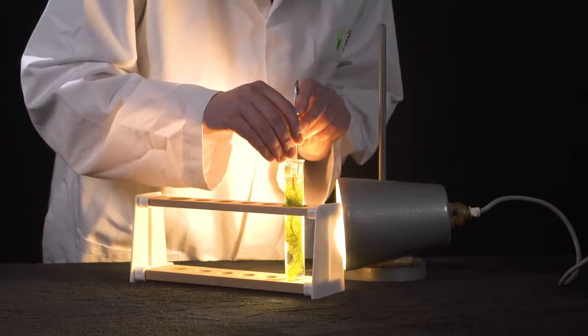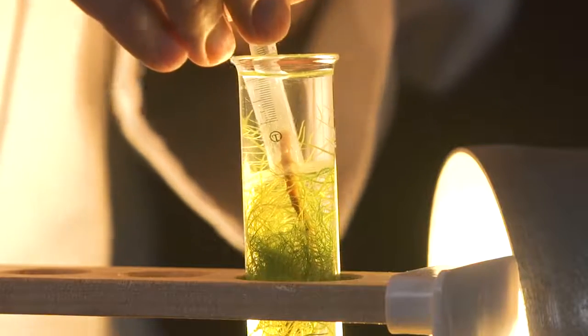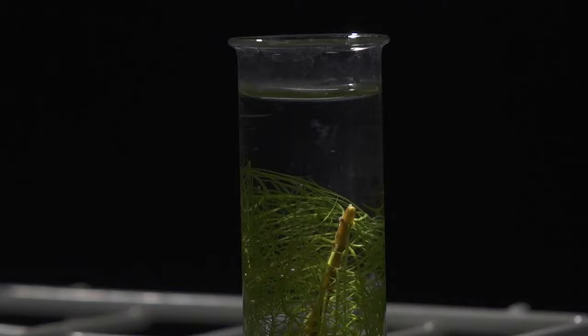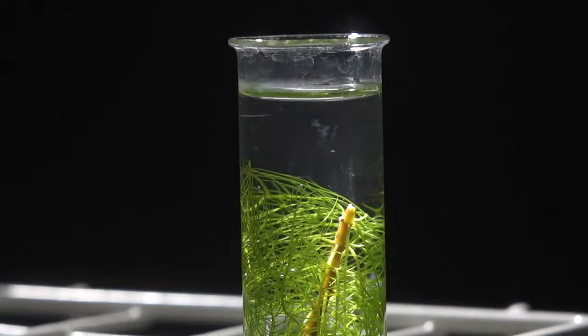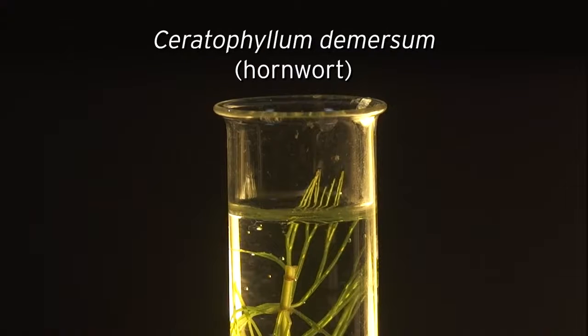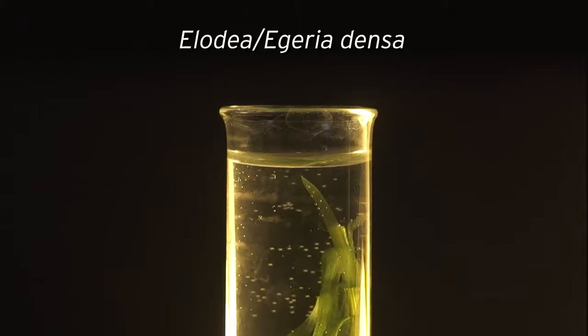I hope that we have shown you here that you can make the bubbling pondweed practical a success. All of the species we recommended produce bubbles, and the bubbling rate will respond to changes in light intensity, showing your students that light intensity affects the rate of photosynthesis. Different species produce different bubble sizes, which means that this change may be more or less obvious, but all of them can be used successfully.